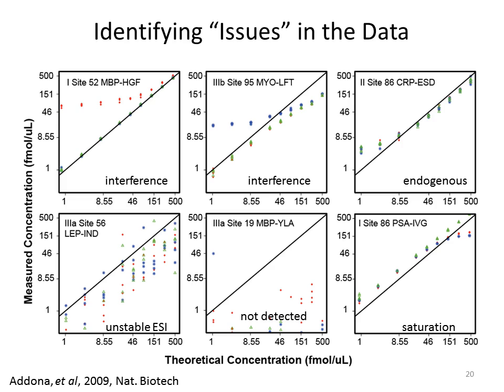On other instruments like Orbitraps and FTICRs, you're not detecting signals hitting a detector or some kind of detector assembly, you're actually monitoring their image current. And there are other things that instrument vendors have in place called AGC, automatic gain control, which prevents you from overfilling or saturating and causing that kind of effect. So this is more common on triples. That's a really good question. You're testing me.